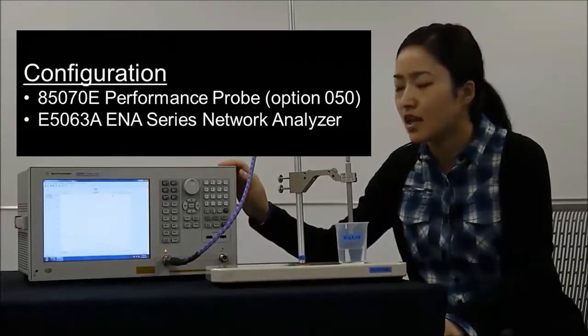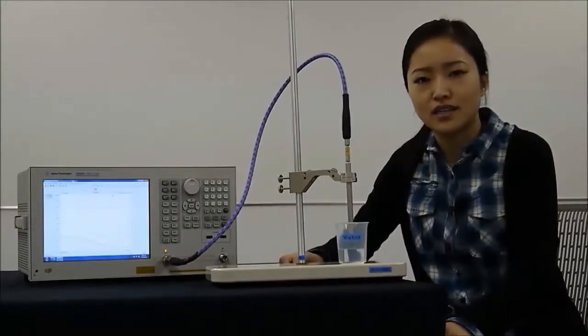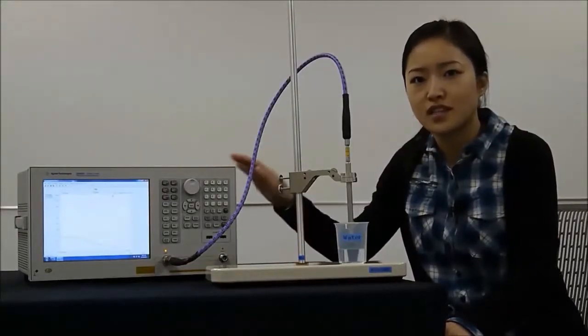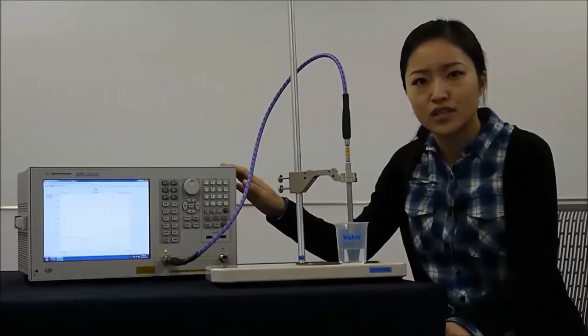For our demonstration here we will use a coaxial probe and an E5063A ENA Series Network Analyzer. The measurement software can run on an external PC or directly on the network analyzer. The software is used to calculate permittivity from the reflection coefficient measurements.